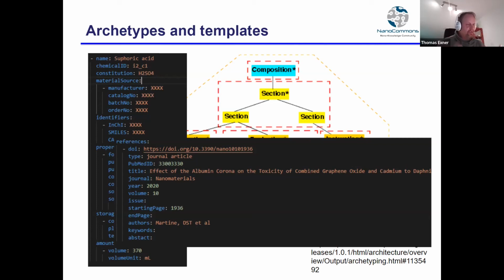You agree on some kind of a template, and then you reuse that all over again, and then the computer can take this information and build a reference out of that, which looks exactly as this journal wants to have that. But it's not any kind of magic, and you don't have to do it differently. And now I knew that I had forgotten somewhere and set, and now I know where it is.